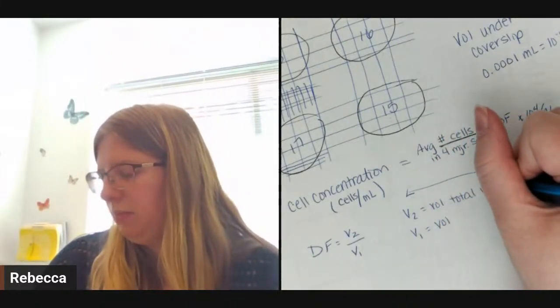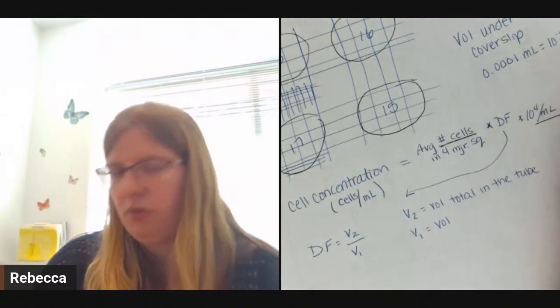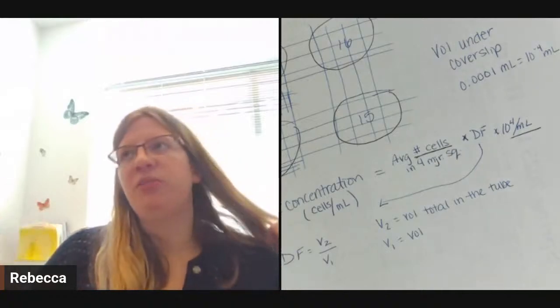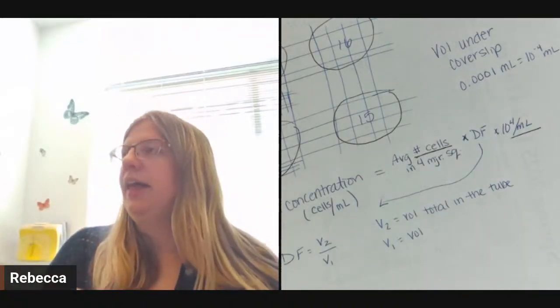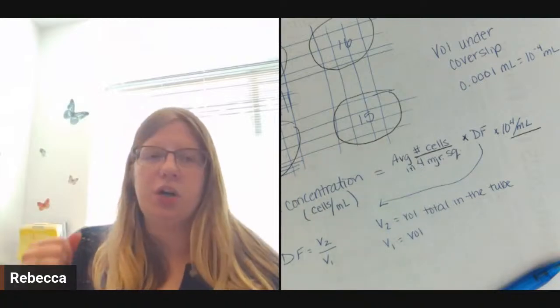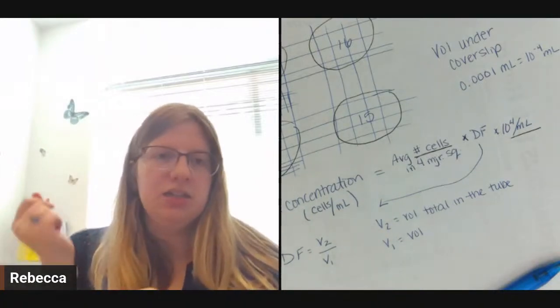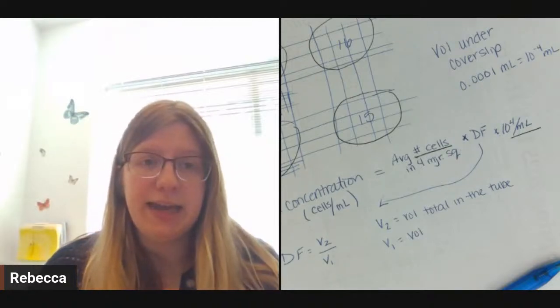basically in the tube, right? Because we use various size tubes, which have specific names, but we never talk about those names in lab really, where we're taking some of our cell culture and some sort of buffer, whether that be PBS buffer like we did in our yeast lab.